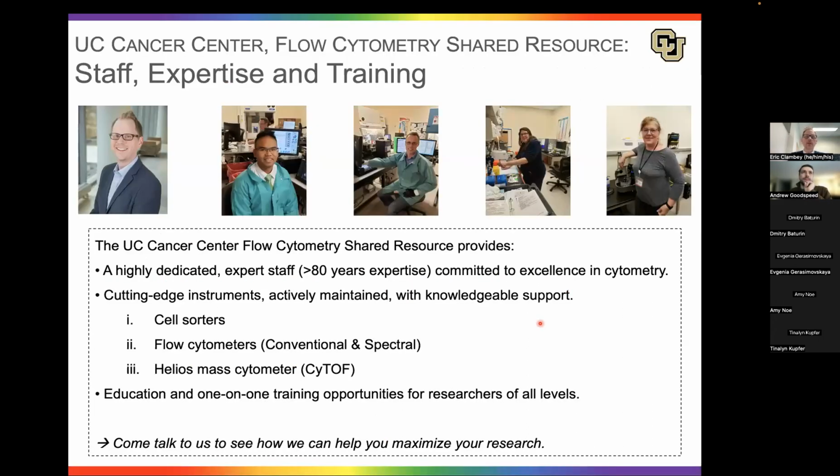Okay, so before I get into the details, I just wanted to point out that one really valuable resource on campus that you have access to is the Cancer Center Flow Cytometry Shared Resource. I'm the director of that. Christine Childs is the manager, and we have an amazing team with Lester, Dimitri, Christine, and Chris. We are highly experienced. We provide cutting-edge instruments for all the technologies that I'll discuss today. And we also provide extensive education and training opportunities. So please, if you hear things that you'd like to learn more about, I'm happy to take questions, but our team is amazing and will absolutely be able to help you.